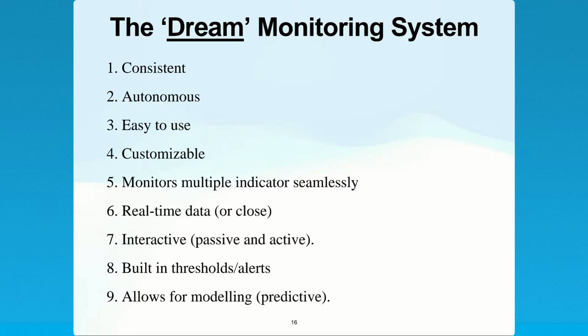I'd like it to be real time or close. I want it to be interactive. So I don't want to constantly look if I have a problem. It should be telling me I have a problem. It should interact with me in some manner to say, hey, buddy, I know you've got me in the back and I know I'm looking at your data. You need to look at this now because now you have a problem. You haven't had it for 6 months.